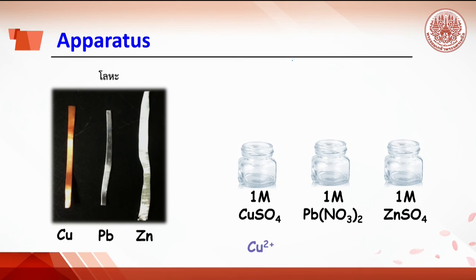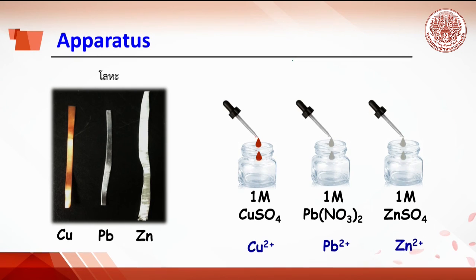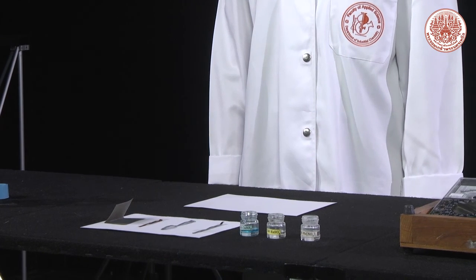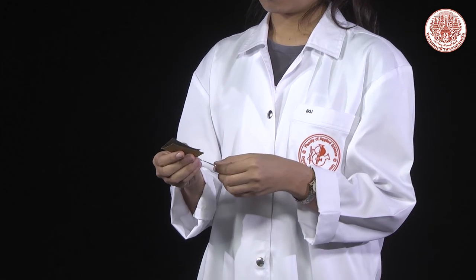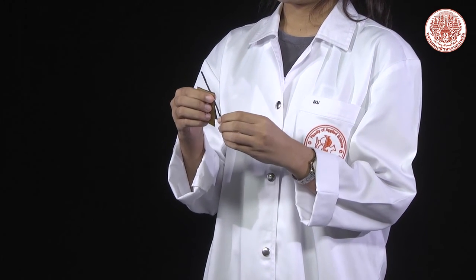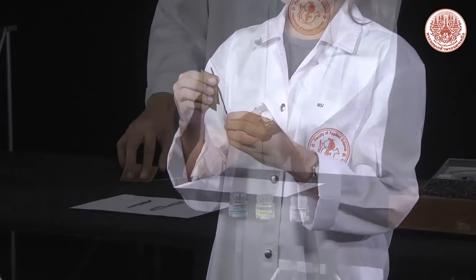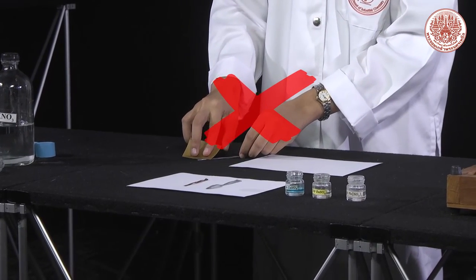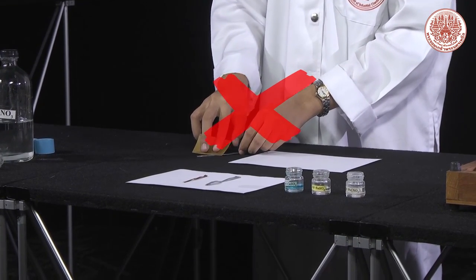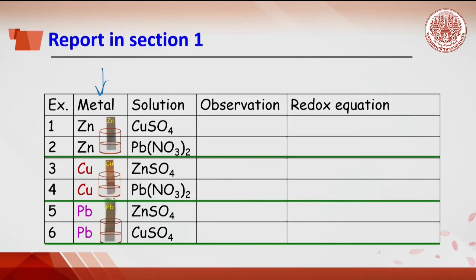Drop copper ions from 1 molar copper sulfate, lead ions from 1 molar lead nitrate, and zinc ions from 1 molar zinc sulfate. Then clean each metal strip with sandpaper to remove oxide or surface film on the metal. Do not scratch the sandpaper on the bench. Place the metal strip into the solution. After 30 seconds, record the observation.